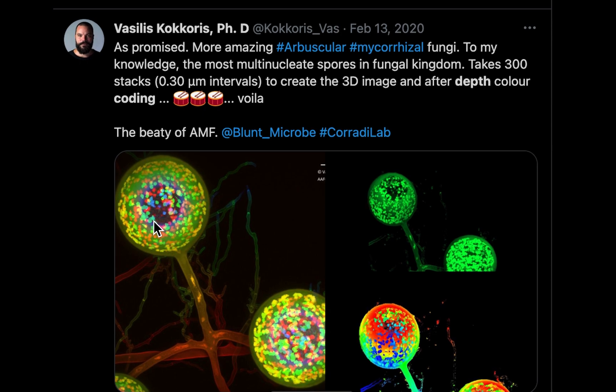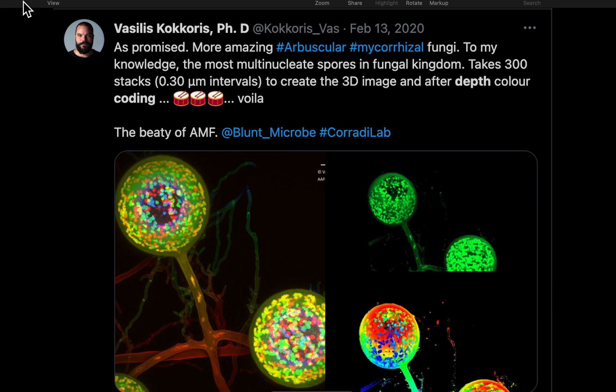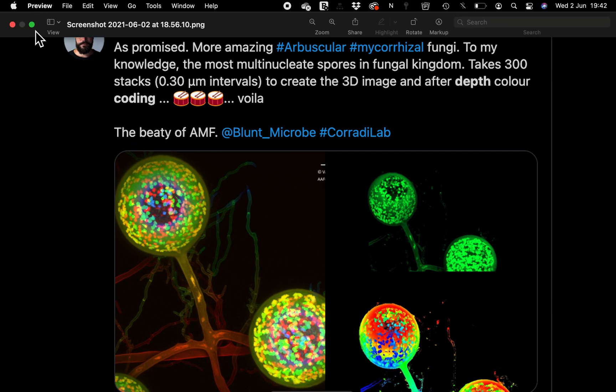The arbuscular fungi has been color-coded to show the different nucleus, because this particular arbuscule has several nuclei within its arbuscule. The different colors are showing the different positions where these nuclei were within the Z-stack image.